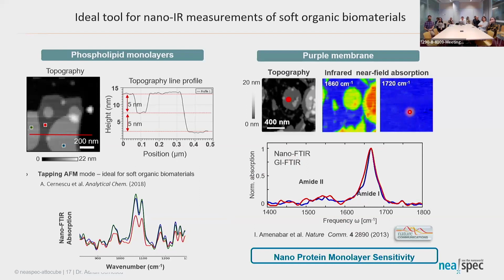Now, the sensitivity of the technique is really, really good. And I could measure even single proteins and could also map something like amyloid fibrils from Alzheimer's disease that show aggregation. I'm not going to present this data here because of the time restrictions, but I want to show you something else.